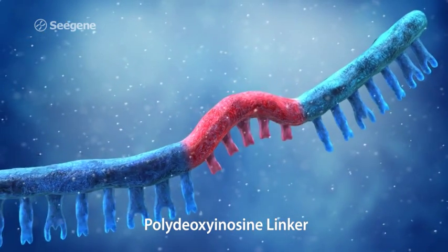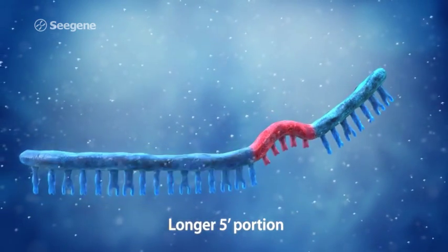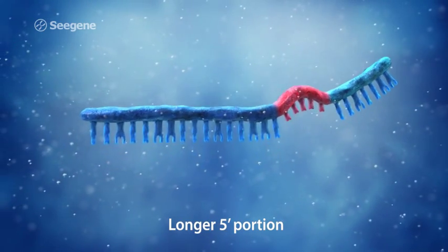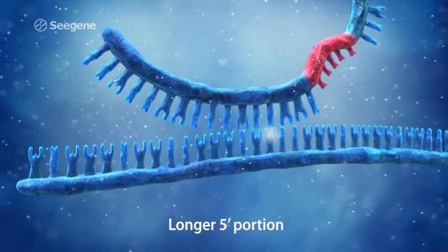Because the sequence of the five-prime portion is approximately two times longer than the three-prime portion, the five-prime portion has a higher TM and will preferentially bind to the template DNA first during PCR. The five-prime portion works as a stabilizer, initiating stable binding of the DPO primer.